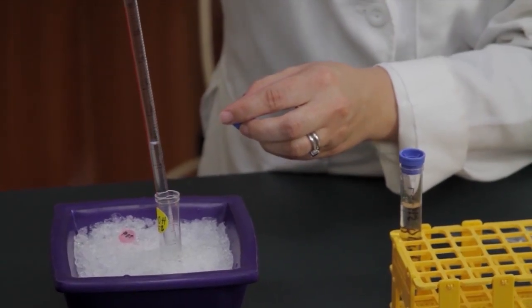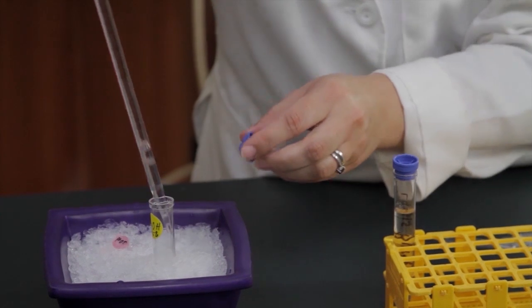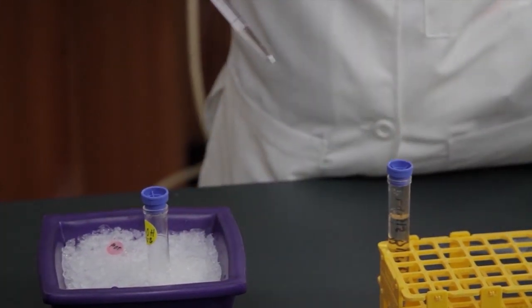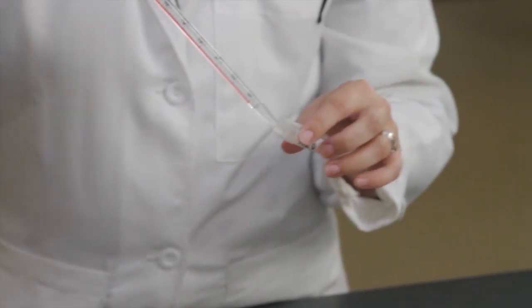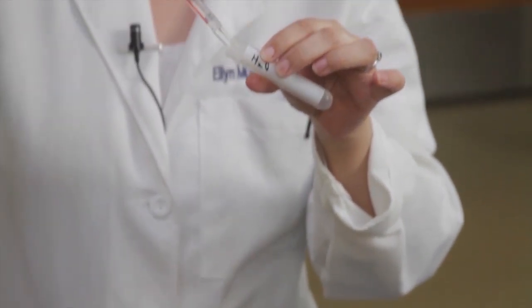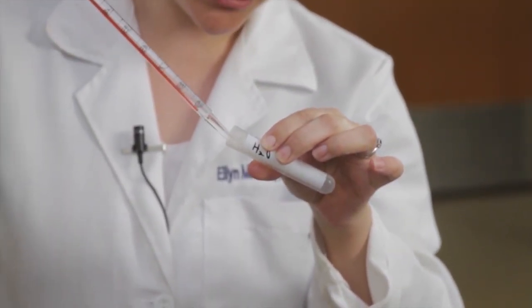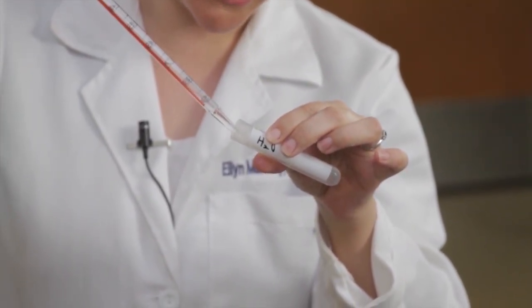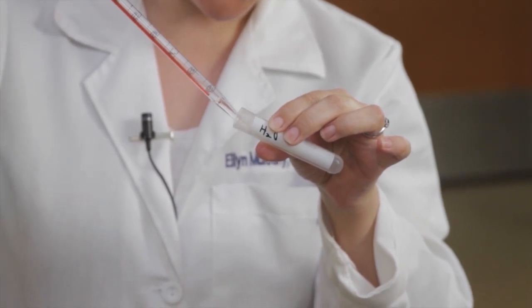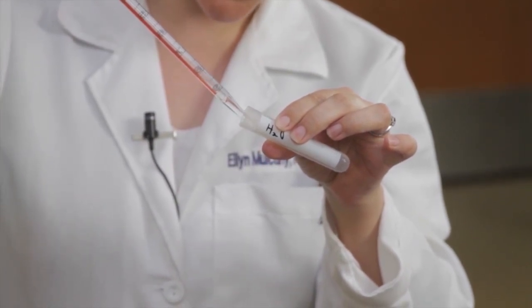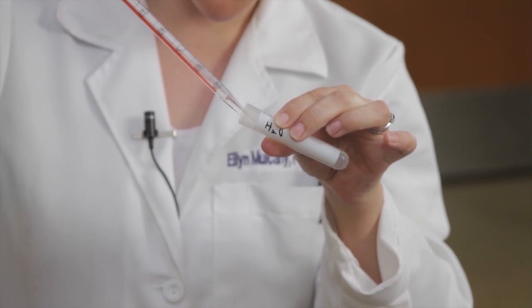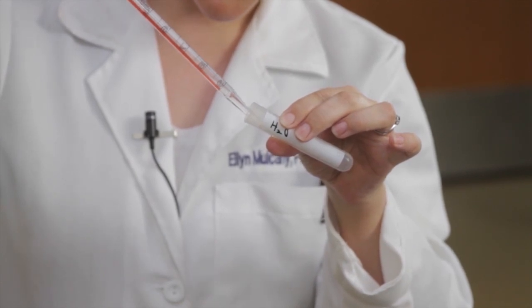The alcohol is on ice. I'm going to add the alcohol at an angle and slowly add it in to our extraction, so that the alcohol runs down the side of the tube. And I'm doing this slowly to create two layers, the aqueous layer and the nonaqueous layer.